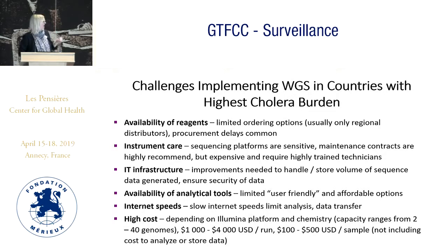And then there is a high cost of implementation, and it varies a little bit dependent on the Illumina platform or whatever the country is using. In PulseNet, we've costed out different chemistries and different platforms with Illumina, and these are the latest figures. And I guess the good news is that we do see a consistent drop in the cost of implementing this technology abroad.